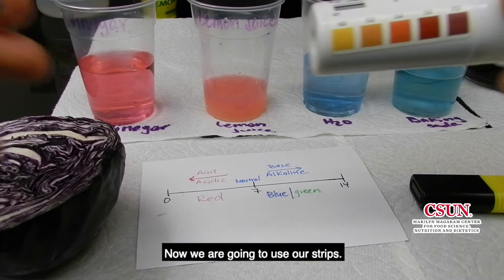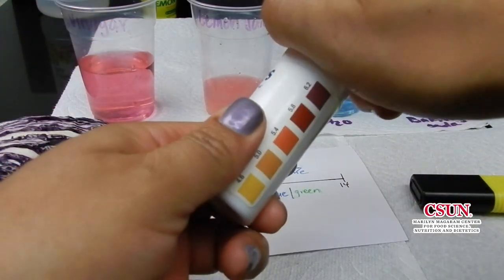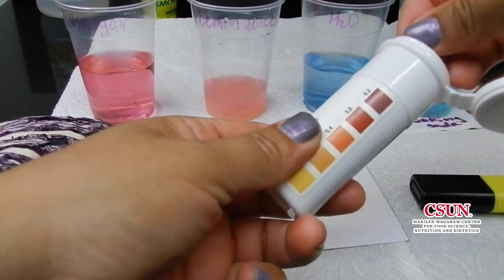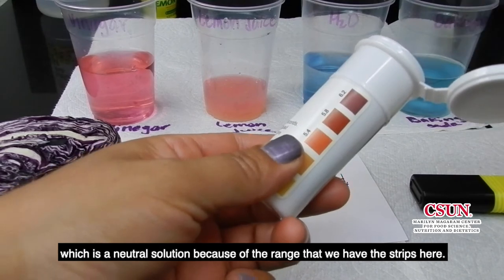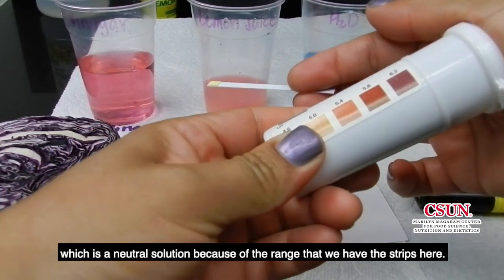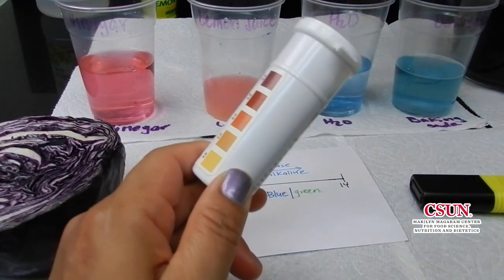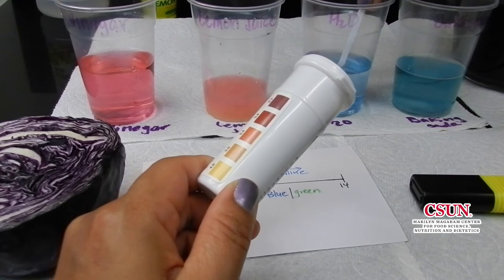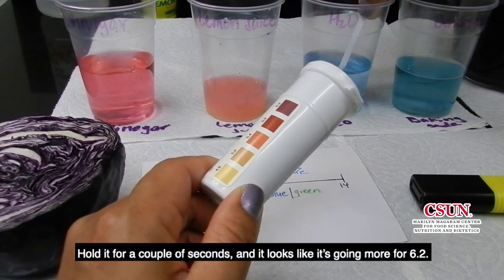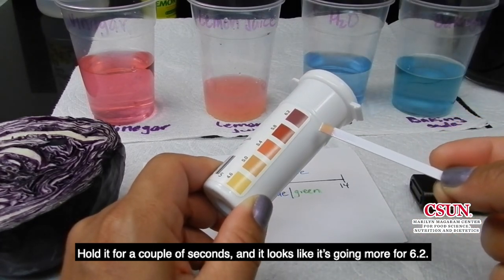Now we're going to use our strip. We're going to go with the water, which is the neutral solution. Because of the range we have on the strips here, it starts from 4.6 to 6.2. Hold it for a couple of seconds and it looks like it's going more towards 6.2.